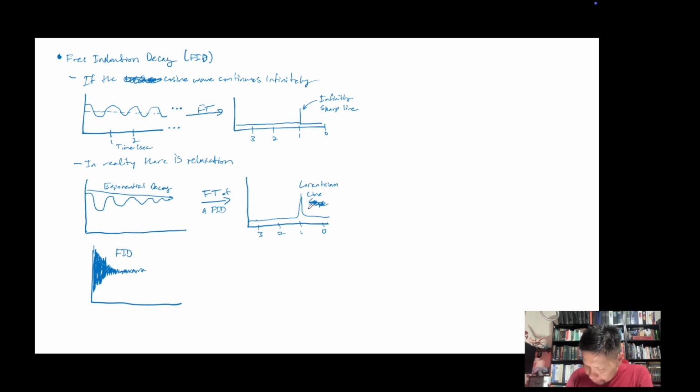Okay, I can write the word shape, I promise. There we go, Lorentzian line shape. And again, that's much more realistic to what you would see when you're taking an actual NMR of a molecule. And the FID that you would see is much more like the one that's down here, not like this, because very rarely do you only have one FID. There's always a crap ton of different types, environments of protons all stacked on top of each other.